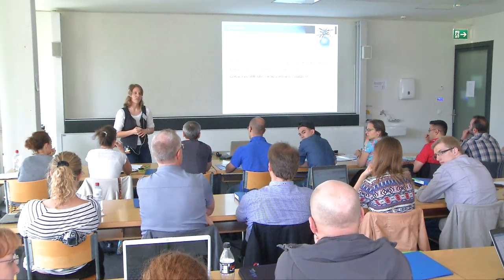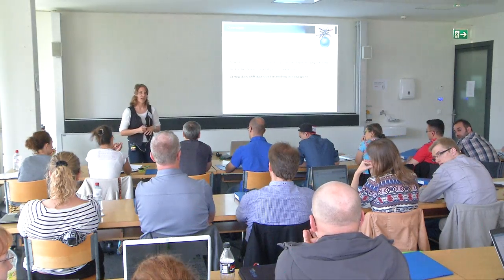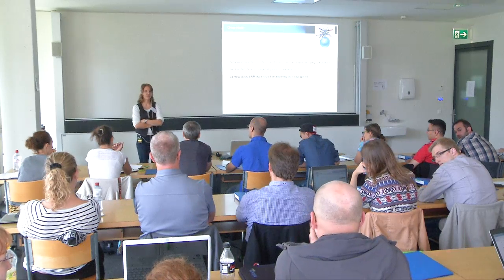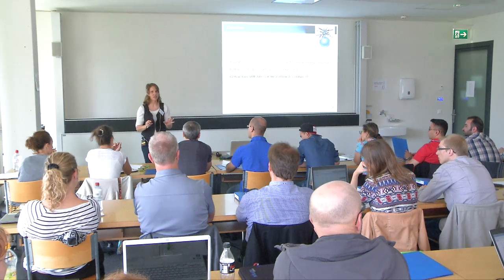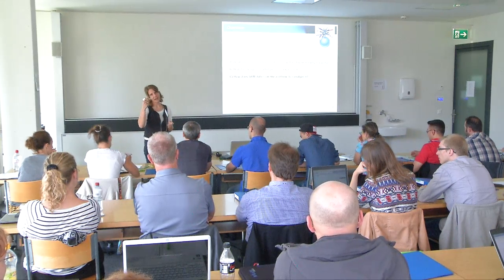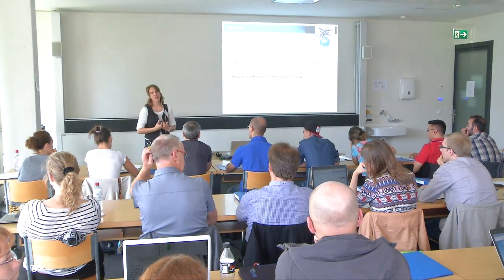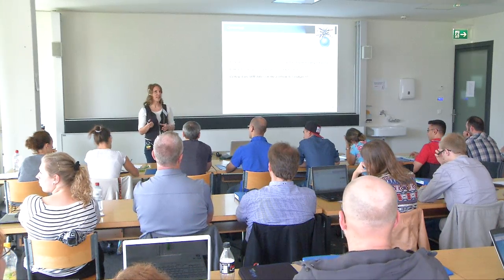Yeah, this is clear, but let's say you want to separate isoforms. Is there a website or a repository where you can bulk import a whole peptide list? So, I'm not an expert in that. Maybe somebody else even knows more. But I think it's mainly on NCBI, where at least for human, you have these canonical and non-canonical sequences to download. How true they are, how complete they are, no clue. But you find these for human.